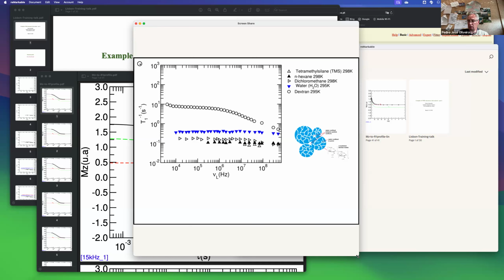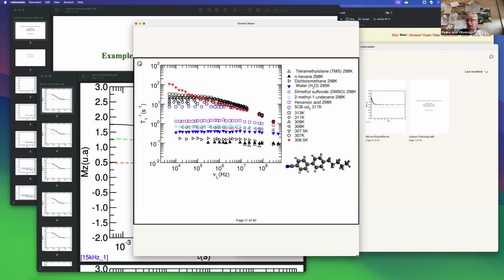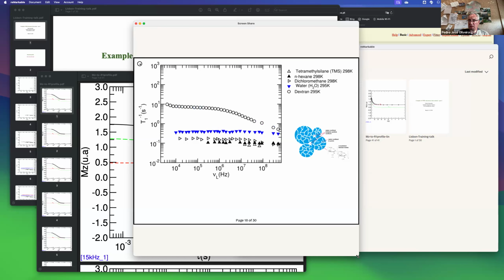And the profile goes in the same range of relaxation rates, and looks like the previous one. So I will just come back, and next you will see the dispersion profile stays in the same area of this plot. And if I change temperature, I also observe differences in this system, okay? And this time, well, actually, I should have chosen the same variation of temperature.